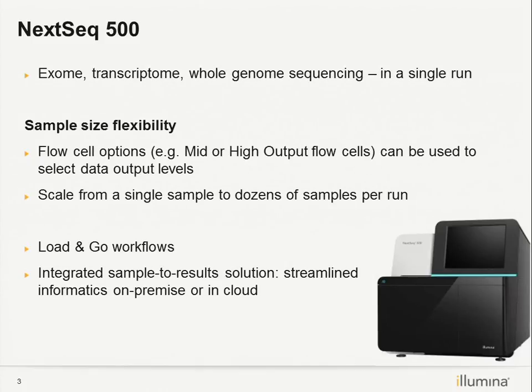So may I know, is the instrument now connected to the internet already? Oh, okay. So if you want, we can try to have it connected, and then we can still have the run uploaded to BaseSpace.